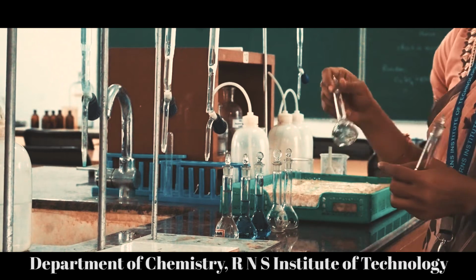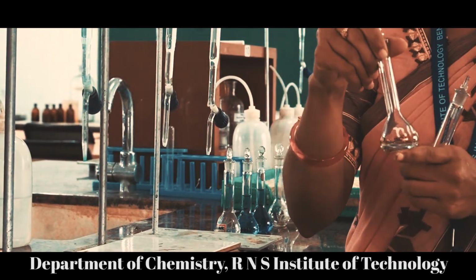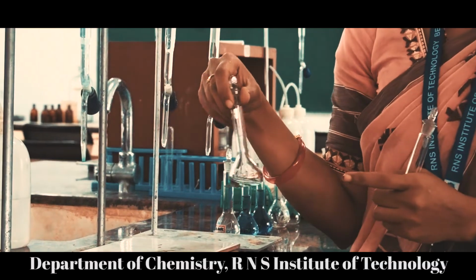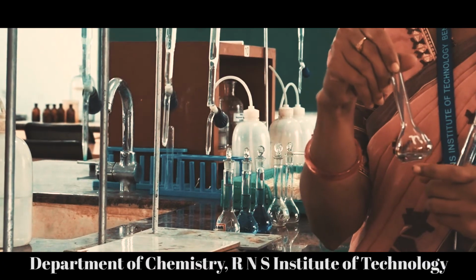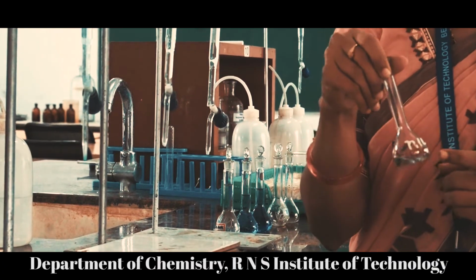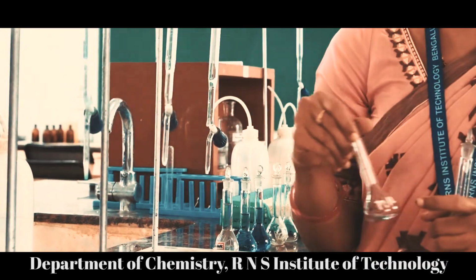And in the unknown solution, a given amount of test solution is taken up, and then the same procedure is followed for the unknown solution also. You are adding 2.5 ml ammonium hydroxide, dilute it with the distilled water and make it up to the mark, and the rest procedure follows.